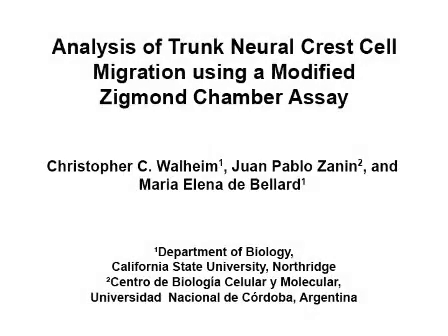The overall aim of this procedure is to evaluate the ability of a molecule to elicit chemotaxis and other migratory responses in explanted trunk neural crest cells.